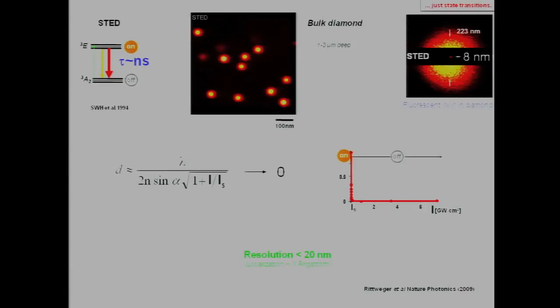Not, this is the decisive step. Certainly not. This is just calculating what it is once you've separated. Separating the feature is the decisive step. Once you've separated, then you can make this calculation of the precision. So why can we separate them?